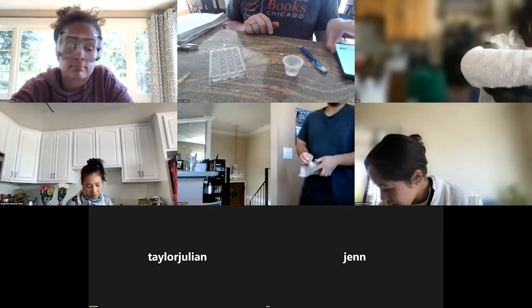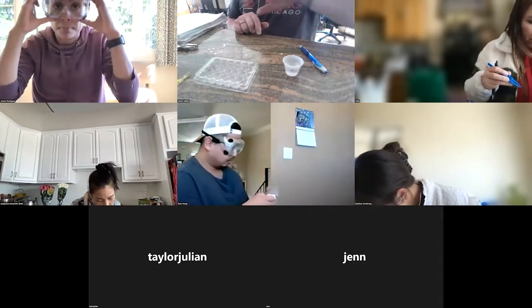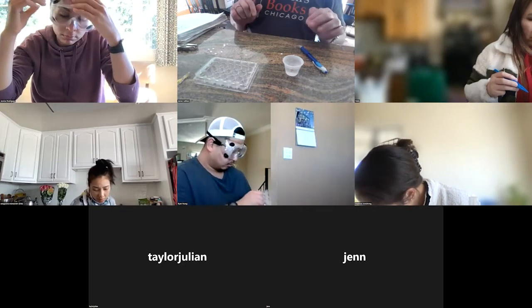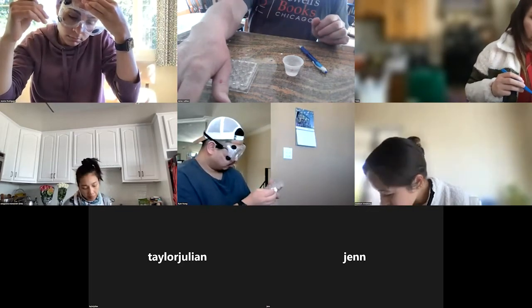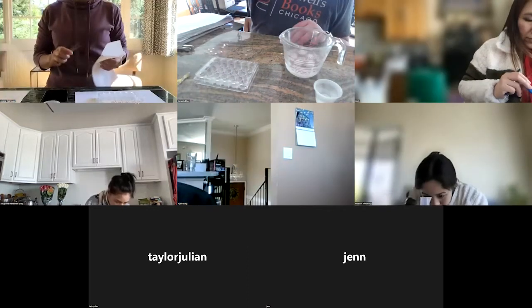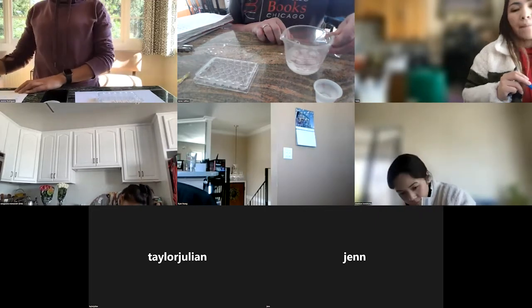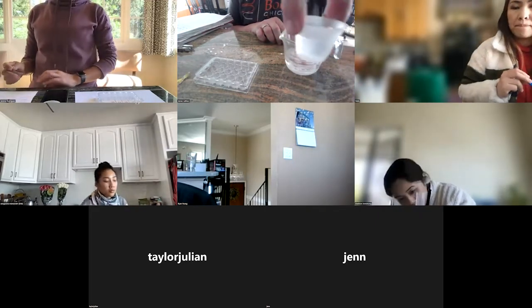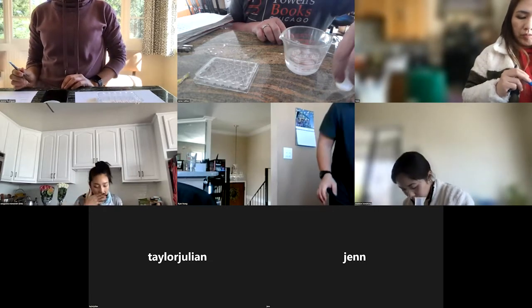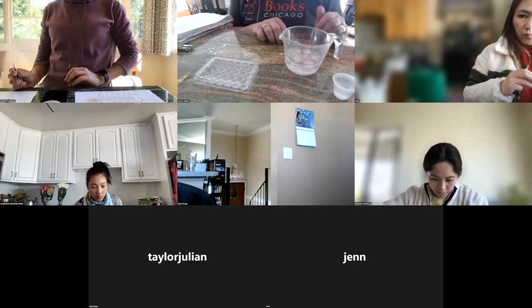Okay, I think I'm going to go ahead and actually try the temperature control. I'm just going to pause for a sec, get that ready. All right, so for the temperature, you make yourself a little ice bath and you take your 1.5% solution and just put it in the ice bath till it's 10 degrees below.